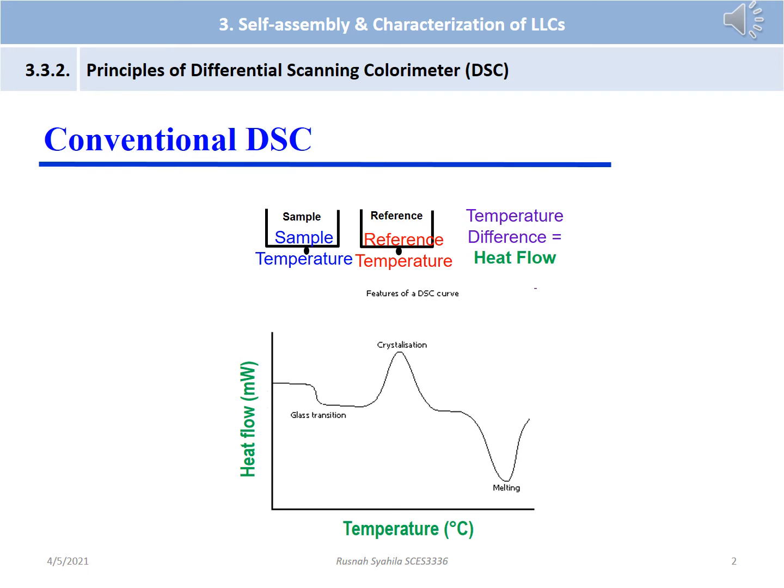The samples were cooled at a rate of -5 degrees Celsius per minute to -40 degrees Celsius, kept at -40 degrees Celsius for 2 minutes, and then heated to the temperature range required. When a melting or freezing transition occurs, the sample pan is cooler or hotter than the reference. Therefore, the instrument needs to supply different heat to keep temperatures the same. The difference allows the heat, the delta enthalpy, and temperature of transition to be measured.